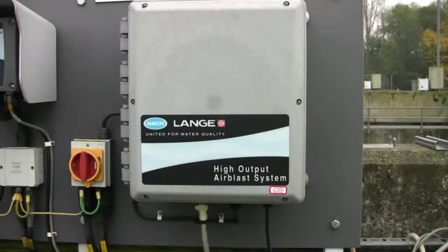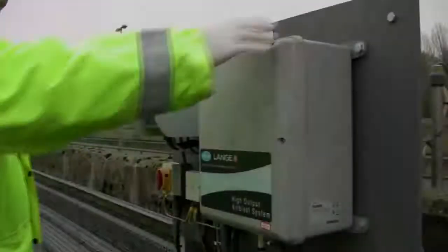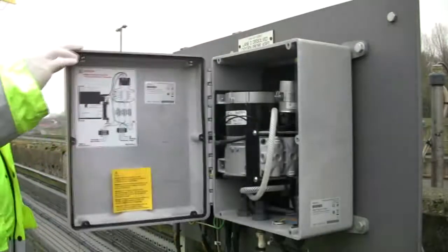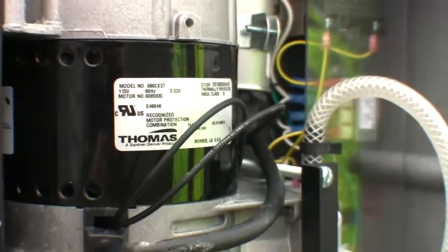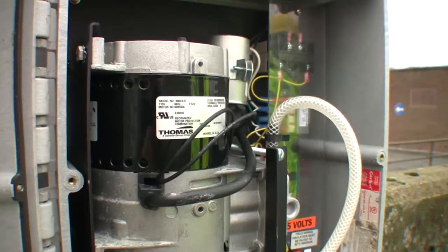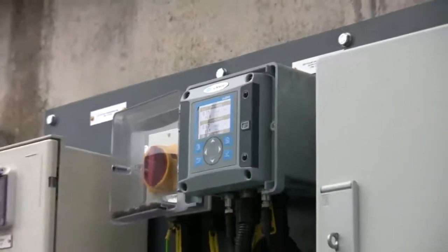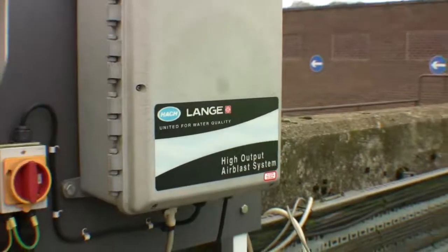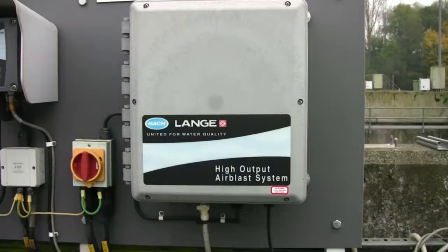Hacklanger offers an optional air blast cleaning system for your LDO probe. It consists of a compressor with cleaning head, 7.6 metres of delivery hose, and associated tie wraps. The interval and duration of cleaning are set from the SC controller, as well as the ability of the system to hold outputs after each cleaning cycle is finished. This allows the air to dissipate and avoids erratic readings or spikes from the probe.